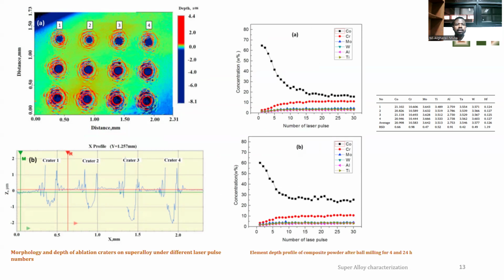So, as we are seeing here in the left photo, it's given the distance in millimeter. It's an area, and inside this area, there's a detection depth. So more ablation for a surface means more penetration. So here we are seeing different craters. More pulses means more in-depth penetration. So here in this example, the penetration is still 8.1 micrometer as we are looking here in the back. So this method is giving depth profiling until minus 8.1. We could increase it by just increasing the pulse rate.